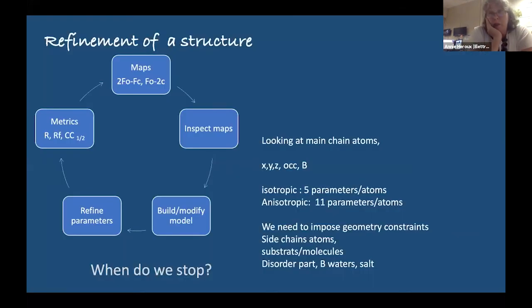So you have your starting point. Now we're going to go through the refinement stage, and it might not be as exciting as you think. This will include making maps and building an initial model. From that initial model, you can recalculate with this position what structure factor it corresponds to. And now you need to basically make a difference between what you have observed and what you are calculating. And like any refinement, you want to make those two as close as possible.